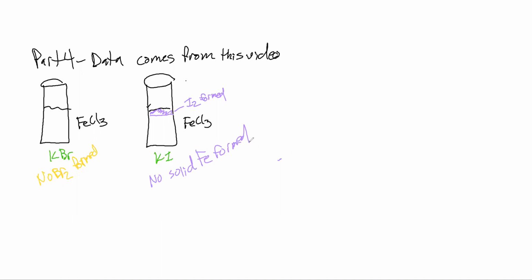So we've done it now with our FeCl3. The next thing that we're going to do is to that sample, we're going to add in our Fe2+ test. So we're taking each of these and doing another test.